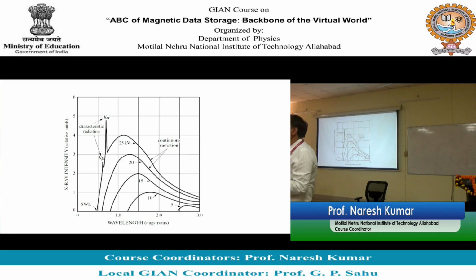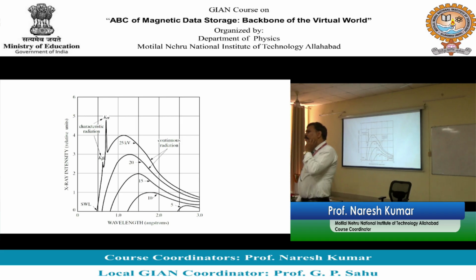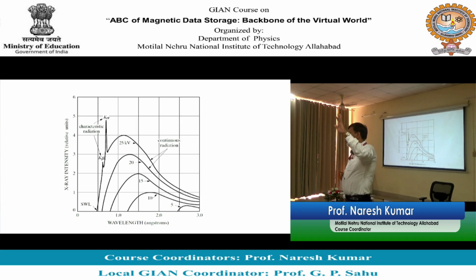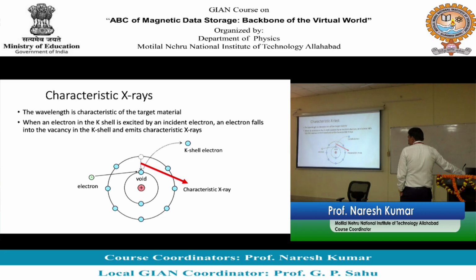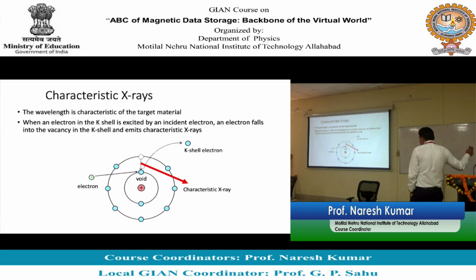तो मुझे करना क्या है? To study crystal structure I need X-ray. Which X-ray? That has only one wavelength. क्या किया मैंने? पहले X-ray प्रोड्यूस किया, फिर मैंने उसके आगे कुछ रख दिया, so that my unwanted X-rays are stopped or absorbed. Only the required or needed X-ray is coming out. That needed X-ray is my characteristic X-ray. So, I hope you know what is characteristic X-ray.